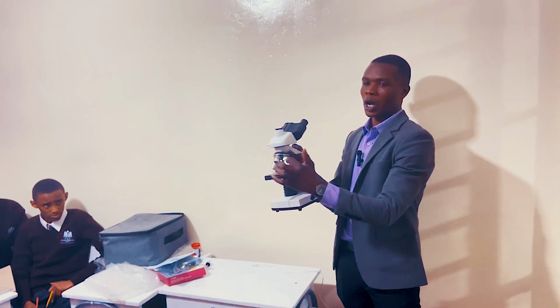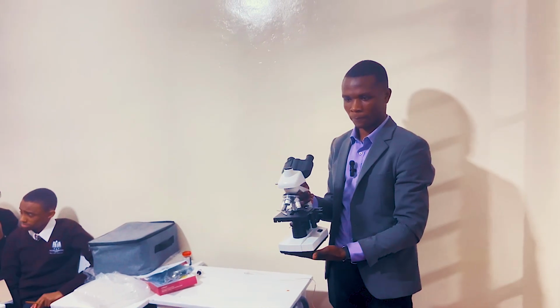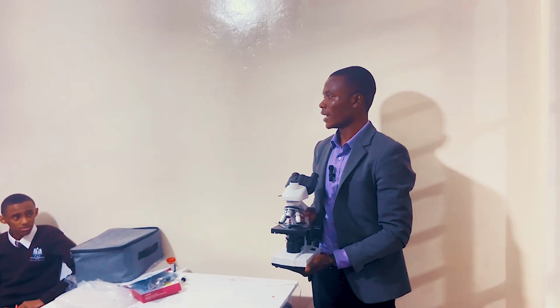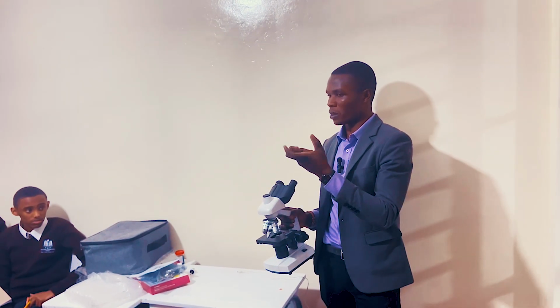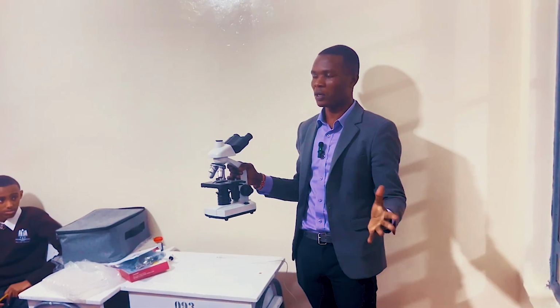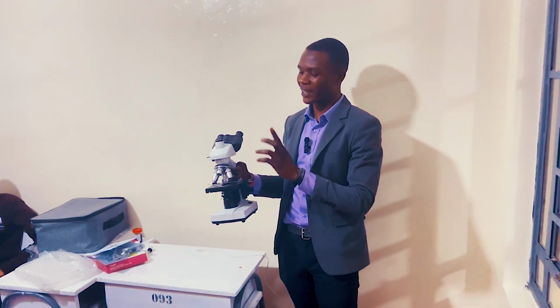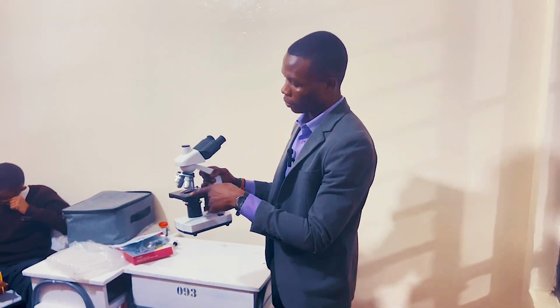There are these four. How do you call these four? Najat? Objective lens. And remember, we said objective lens, it depends on the view you want. If you want it to appear bigger, big, or the biggest, you use this objective lens. And they are labeled. So each of them, for example, this one is labeled.